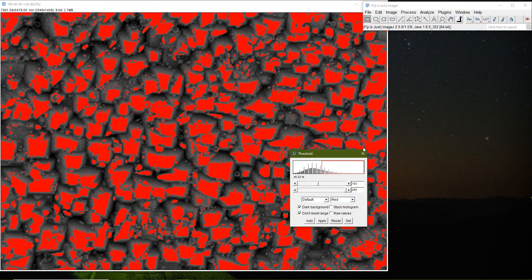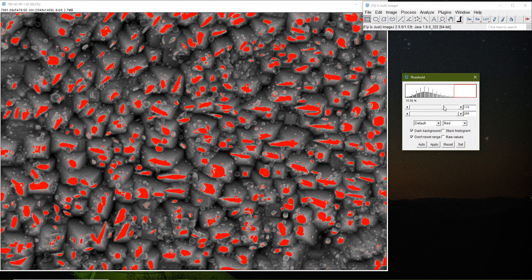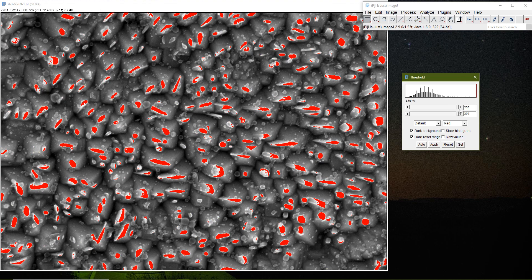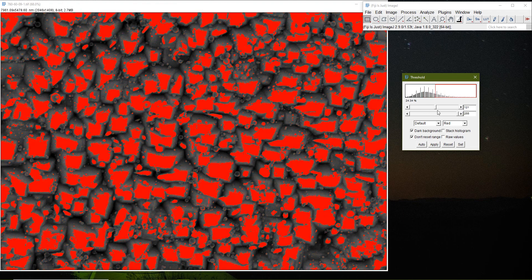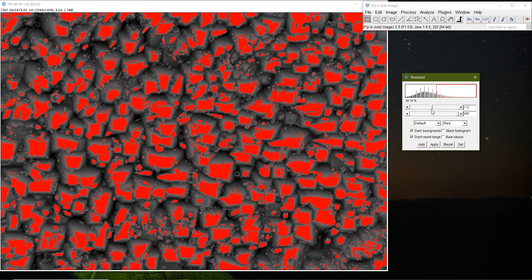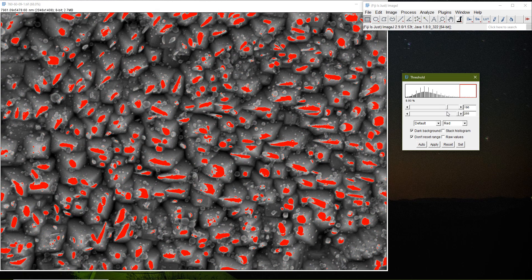Now I go to Image > Adjust > Threshold. This is where we play with the threshold settings to identify the particles. Basically, I'm adjusting a grayscale value cutoff: if a pixel's grayscale value is bigger than a threshold, separate it. I go from the upper side — if I make the threshold very small I start missing particles, and if I make it too big I'm selecting the matrix as well. I have to find somewhere in between.